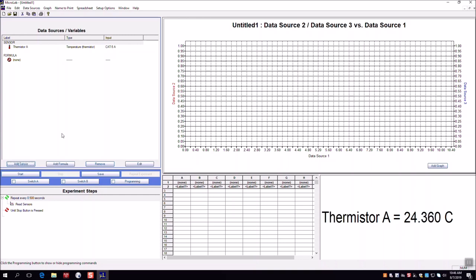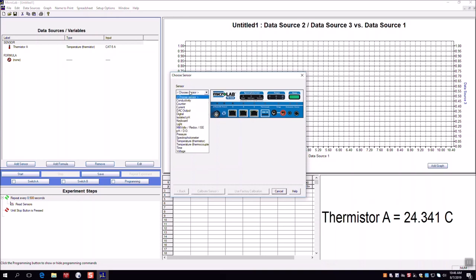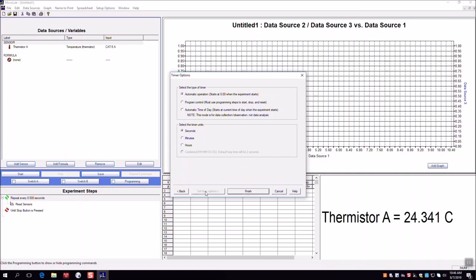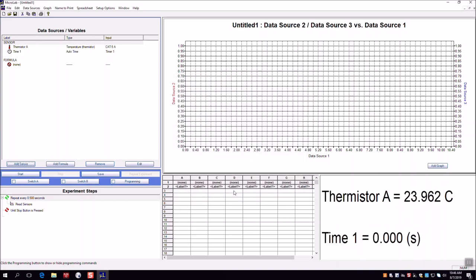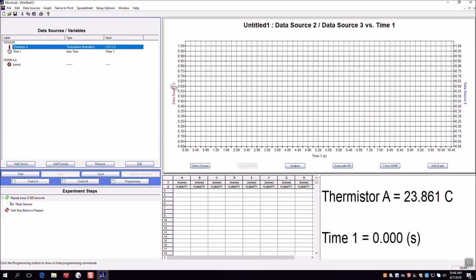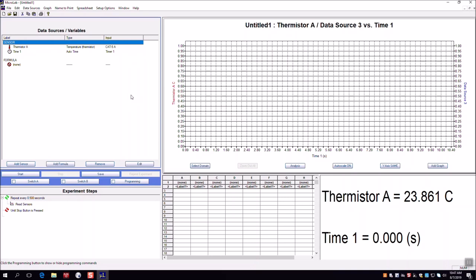The second sensor we need to add is time — we want to measure the change of temperature over time. Add a time sensor, click timer number one, and set the timer options to measure in seconds starting at zero when you hit start. Then drag the time probe to the x-axis and drag the thermistor to the y-axis, so Microlab records temperature versus time.